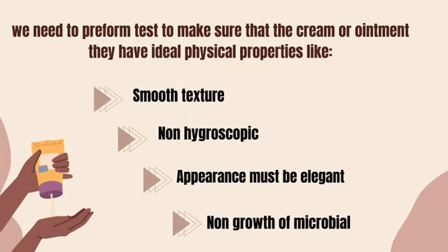We need to perform tests to make sure that the cream or ointment has ideal physical properties like smooth texture, non-hygroscopic, appearance must be elegant, non-growth of microbes.